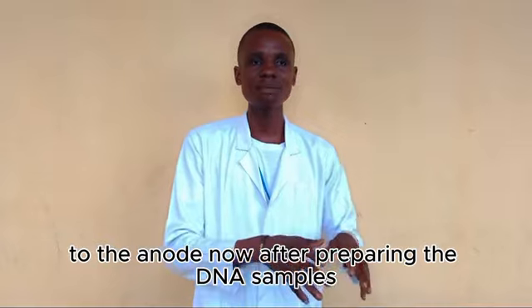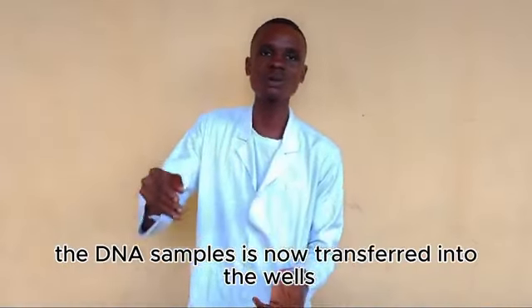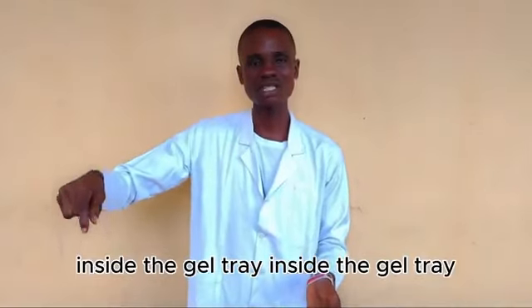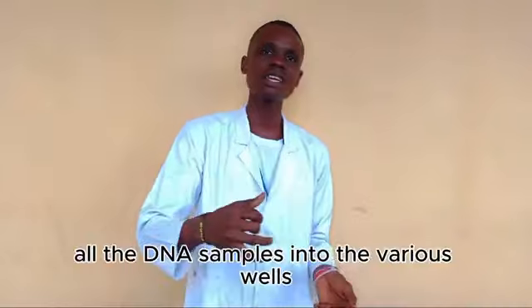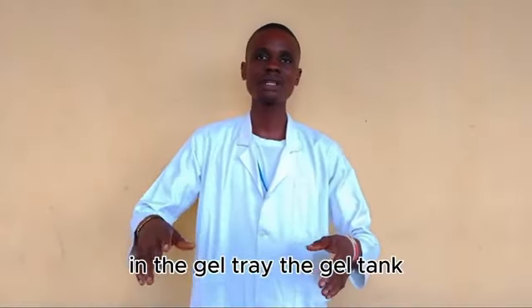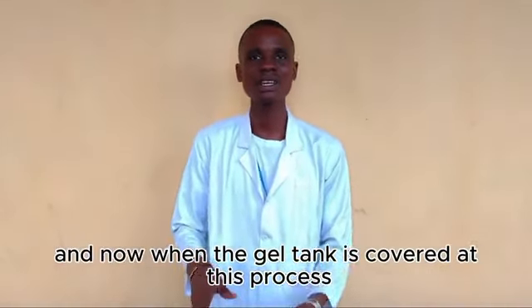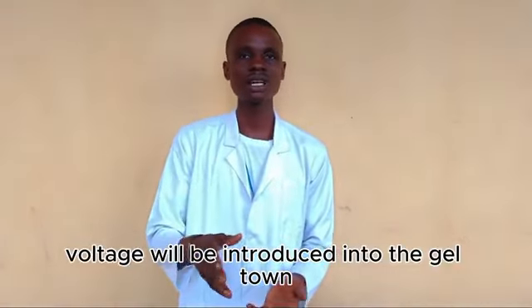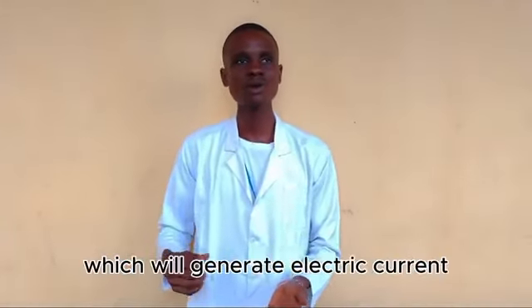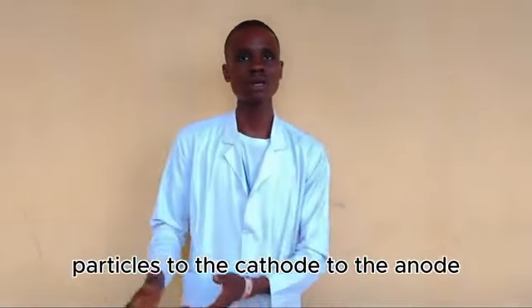Now, after preparing the DNA samples, the DNA samples are transferred into the wells inside the gel tray, and this is done by the use of pipettes. After pipetting all the DNA samples into the various wells in the gel tray, the gel tank is covered. Voltage is then introduced into the gel tank by the use of the power supply, which generates electric current that enables the transfer of the DNA particles from the cathode to the anode.